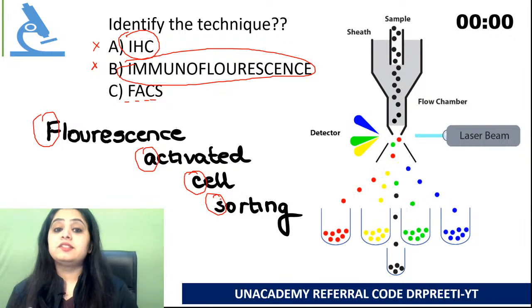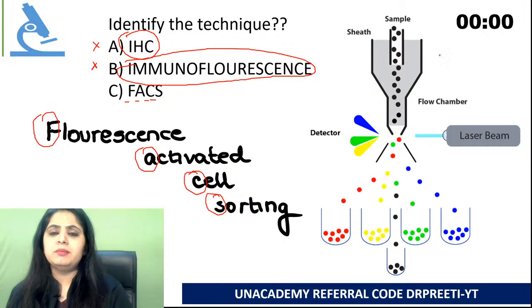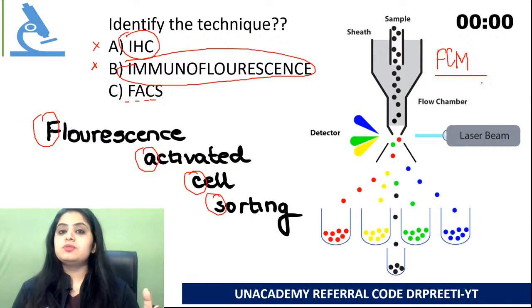Okay, correct. This is actually nothing but a flow cytometer. Why did I start with this? Because recently we discussed flow cytometry. I just wanted to tell you the other name.